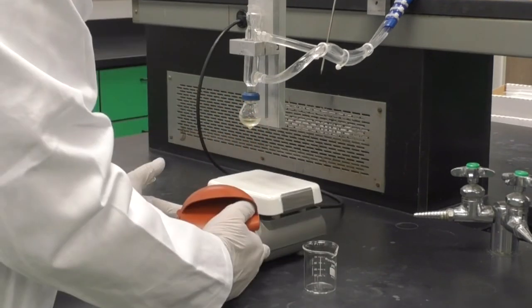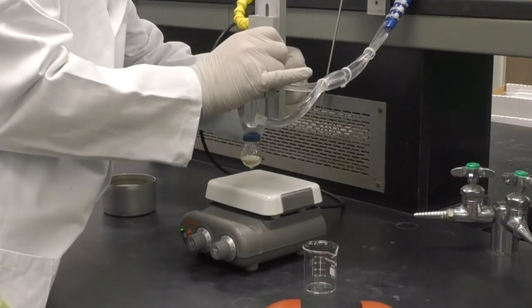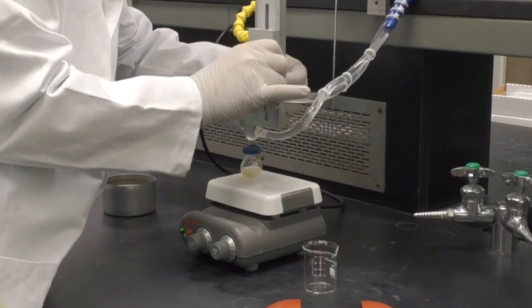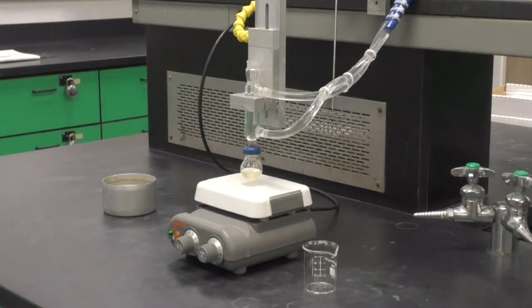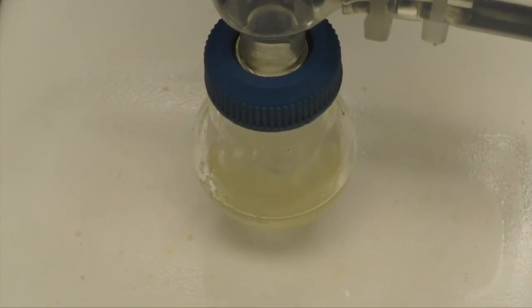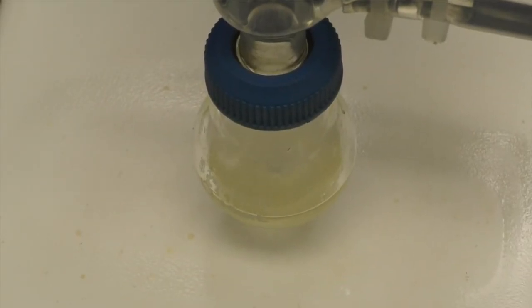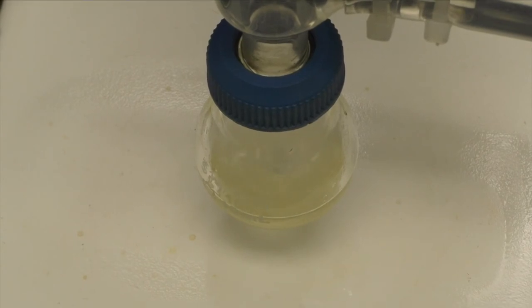Then lower the condenser and flask down to the stirrer hot plate and allow the mixture to cool while rapidly stirring for about 5 to 10 minutes. Make sure you have a good vortex. Your solution should be a little cloudy.